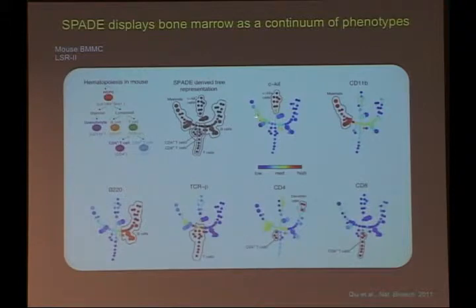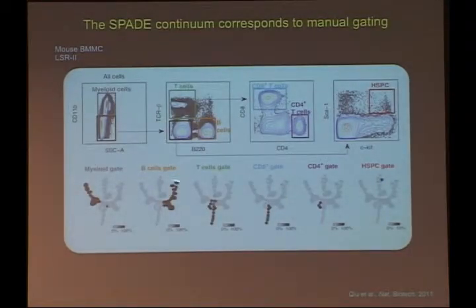And so by drawing little bubbles around each of those cell types, Peng and Kenny labeled this tree into the different known cell types. Now then going backward and to kind of reconfirm that this would make some sense, Kenny went through manually and gated each of those same subsets in the data using traditional biaxial plots, and then overlaying his gating on that tree structure.